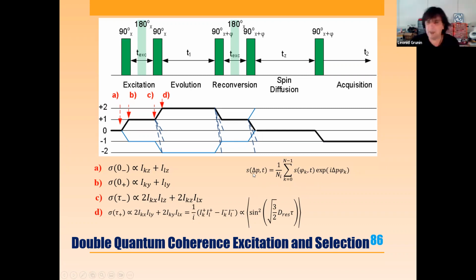So after applying these phase cycling techniques, you will see how this phase cycling works when Esma is going to demonstrate it slightly later. We will get the filtered double quantum signal as the observable FID in the time domain. You will observe anyhow the single quantum transition, but this will bring the information about double quantum levels. Okay, so this is how to make it experimentally.